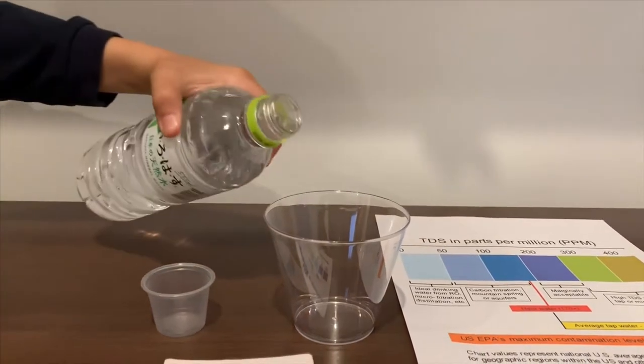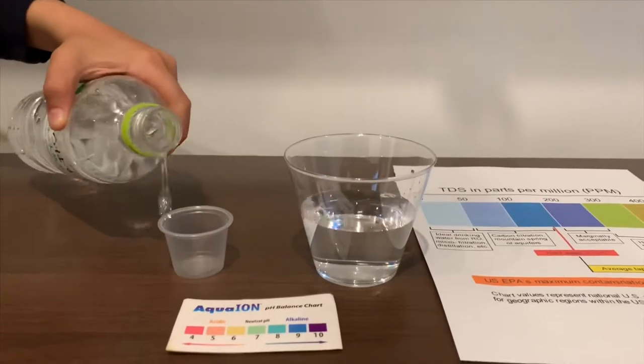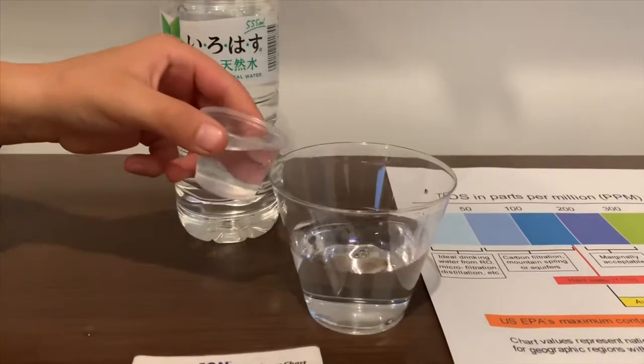Let's pour some water in. This is a little too much for the pH cup. Let's pour some back in the TDS.